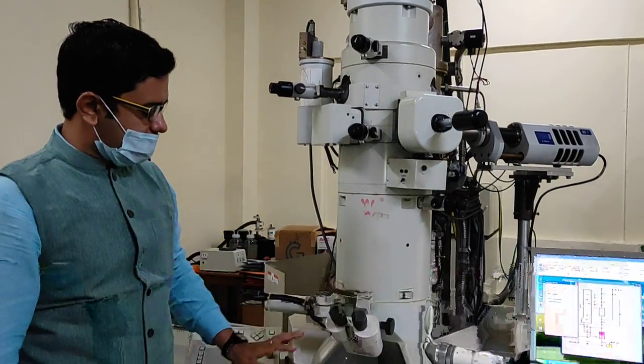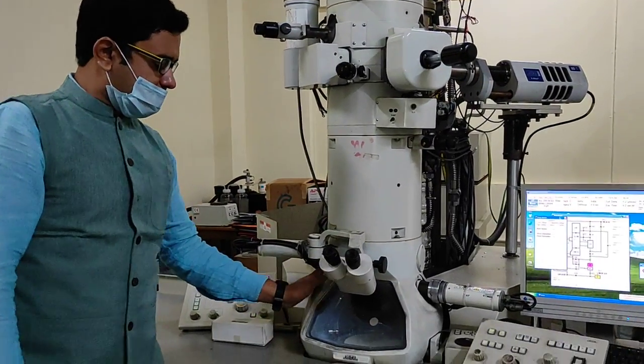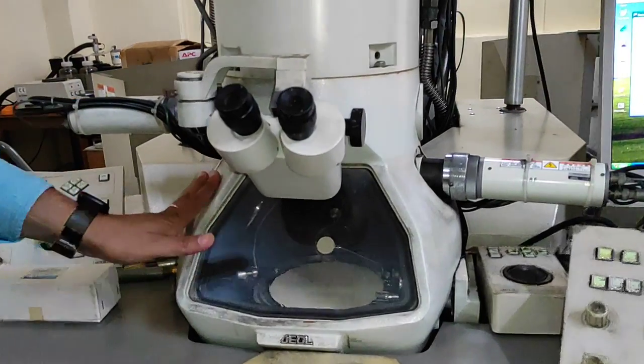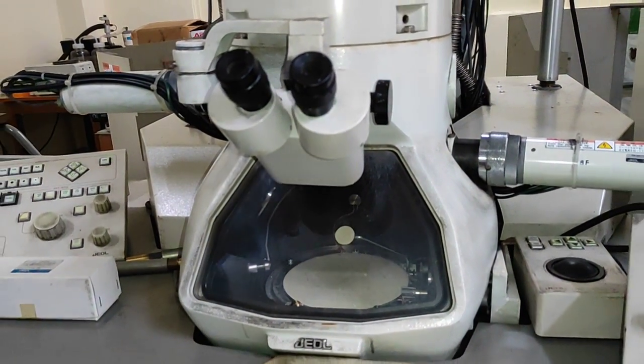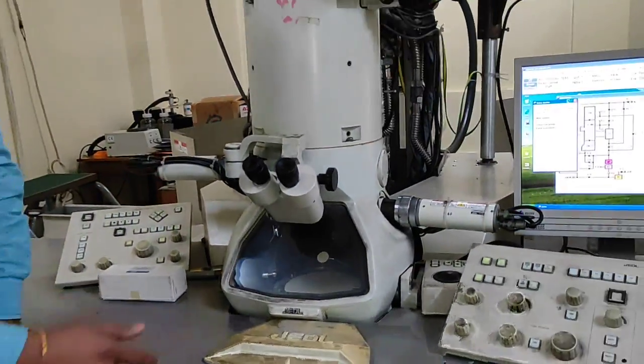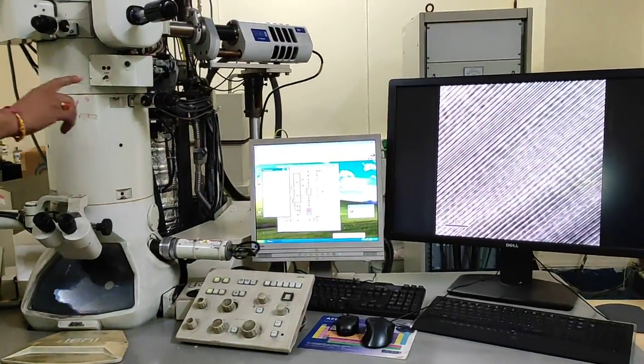This is the lower part of the column and this is the camera chamber where the image of the sample is being formed, which is transferred to the CCD camera situated below. Through the CCD camera we are converting the electronic image to digital.